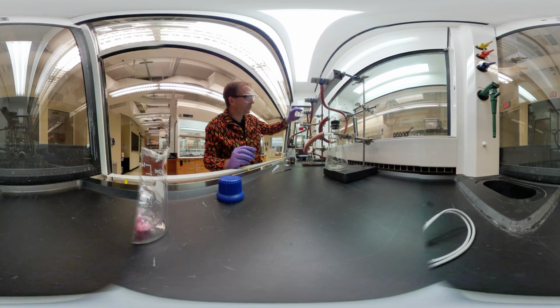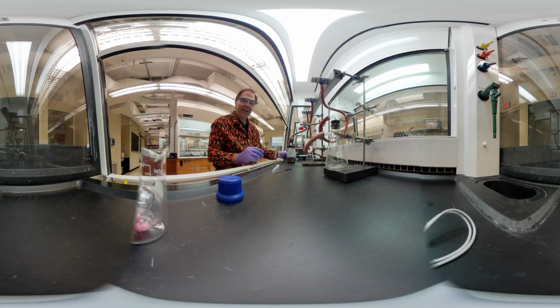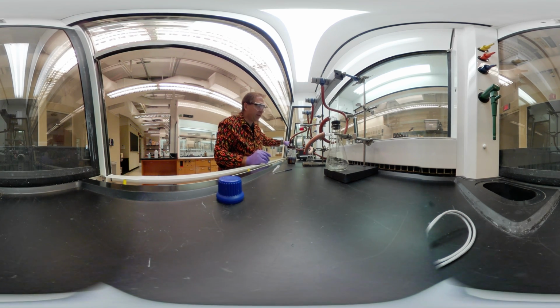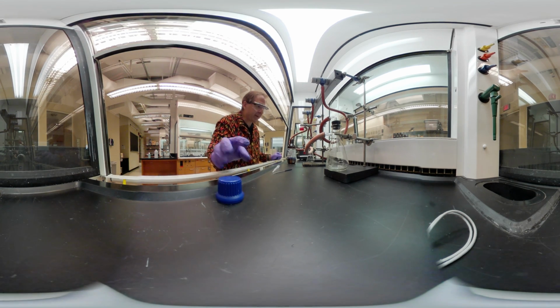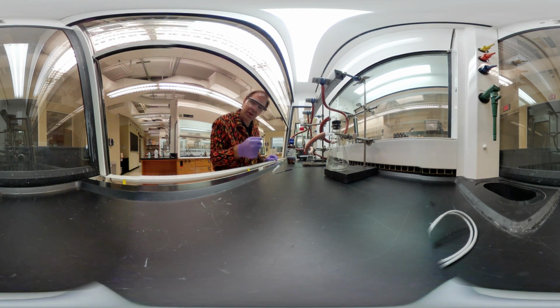And go there. Alright, we got our nice red color. And again, our product, our PTAD that we want, is here in the liquid state. So we're going to take that over to the fume hood, and that's our dienophile, and we're going to react that with 2 different dienes and see what kind of reaction we can get. See you over in the other hood.